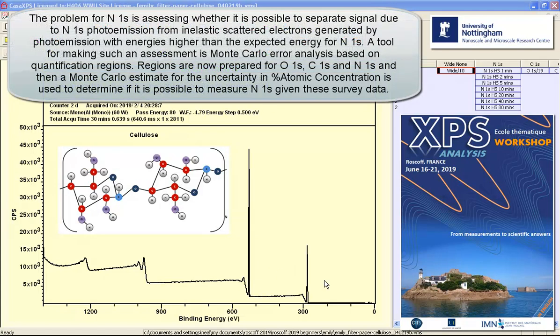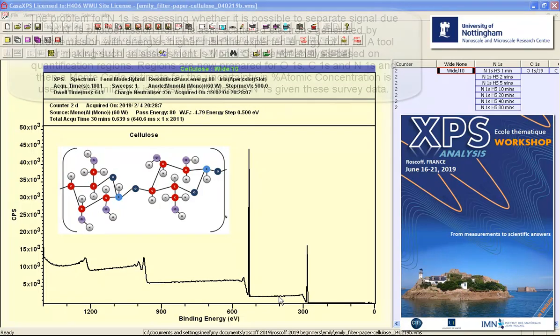The fact this oxygen 1S appears is a function of the sample itself. So the characteristics of the spectrum is determined by both sample and acquisition conditions and both have an influence on whether we can detect a peak or not such as this nitrogen 1S.